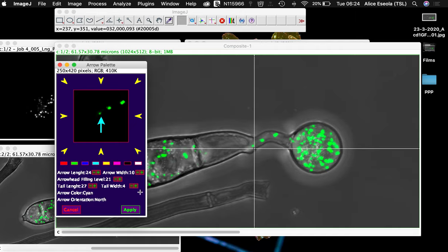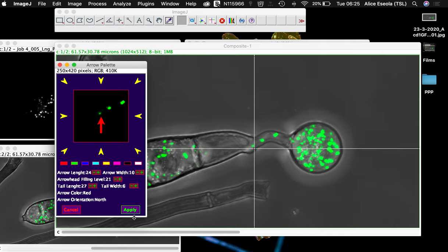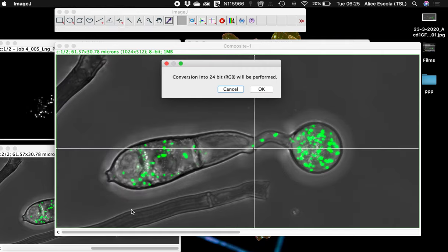It's possible to change the length of the arrow head, the width of it, the tail, and the width of the tail. Once you've selected the type you want, let's choose red and click apply.